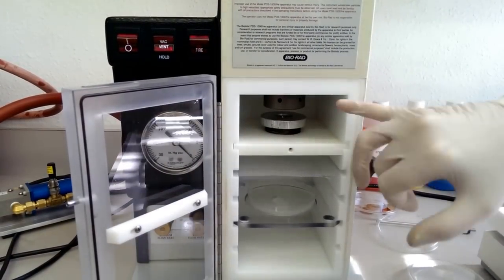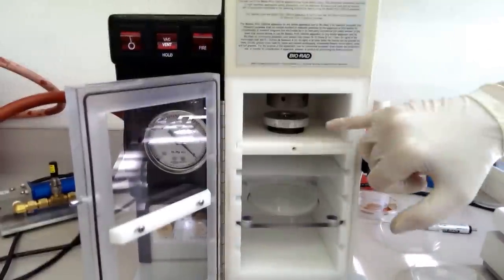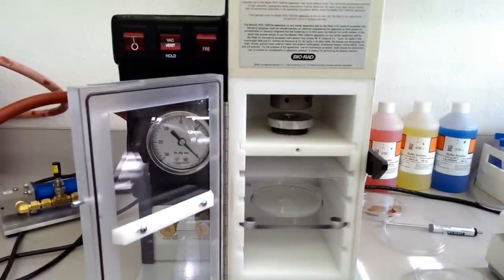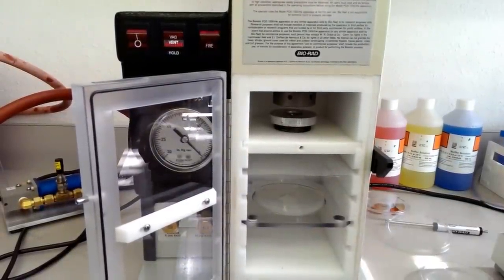And so what we've got here is the rupture disk up here that's designed to break at a very specific pressure. Our DNA-coated nanoparticles are here. We've got the stop screen, and then down here we've got our onion cells ready to be bombarded.